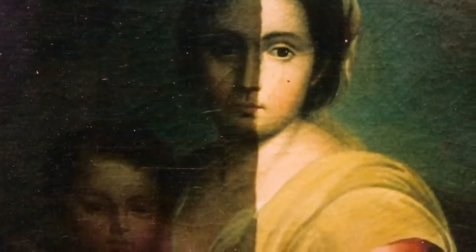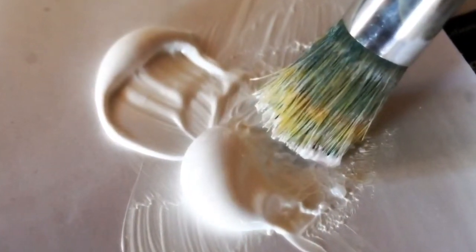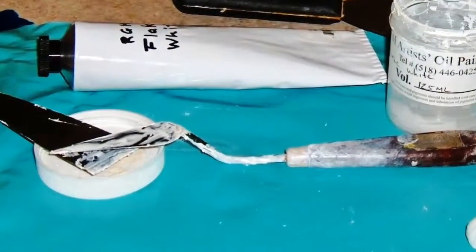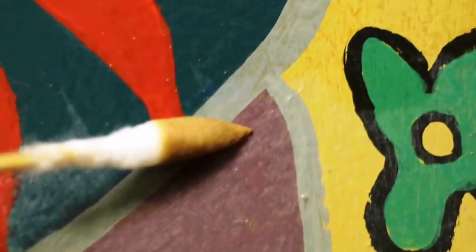Paintings are beautiful, but they are also delicate, and often subject to cleaning or modification by owners, museums, or even sometimes art forgers. EDXF can identify the chemical constituents of the paint. The colour white, for example, used to be made from lead, but more recently has been made from zinc or titanium. In this way, not only are forgeries exposed, but we're also able to understand how an object has been cared for.